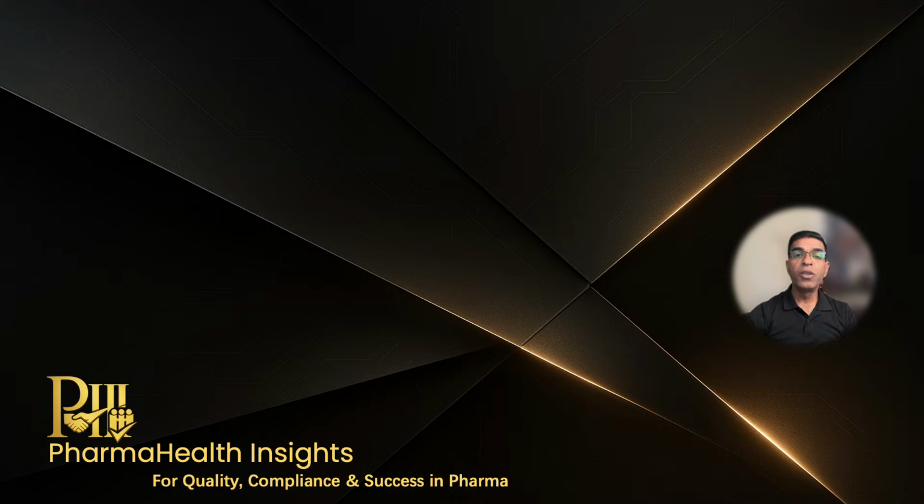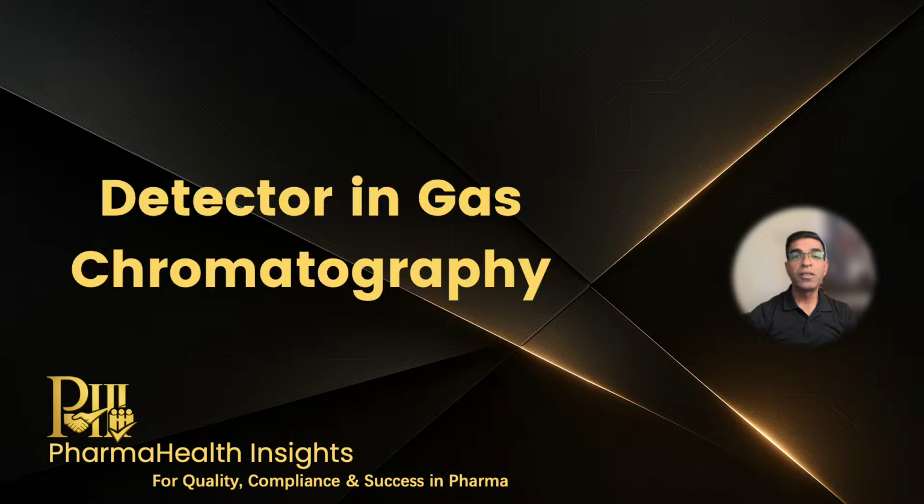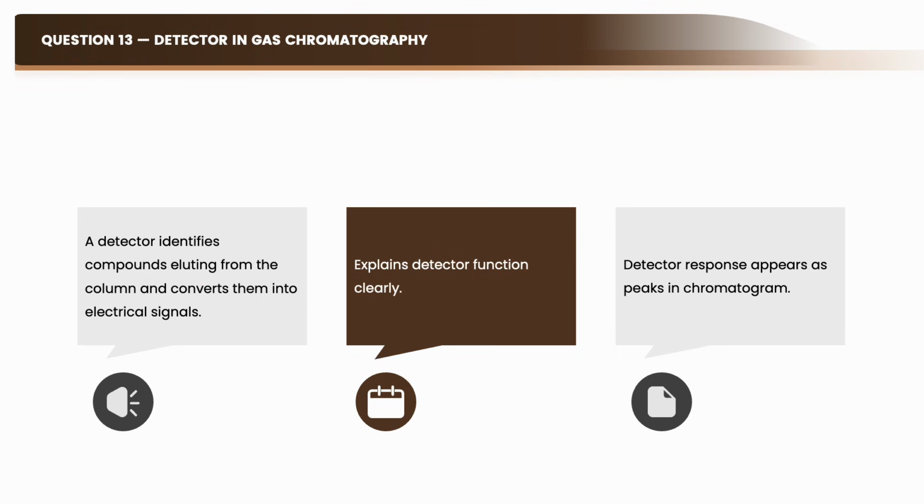Now, the interviewer will move towards detection. What is a detector in gas chromatography? You should always answer like this.